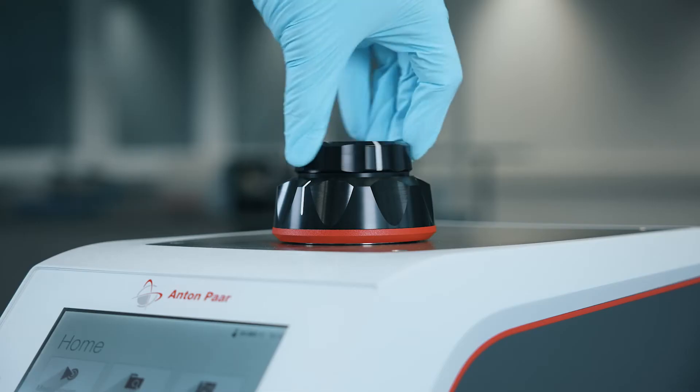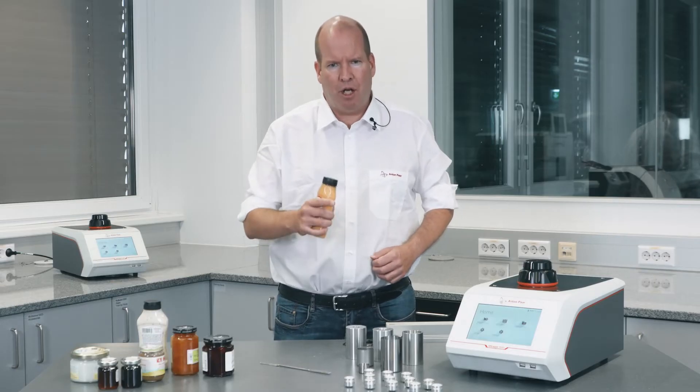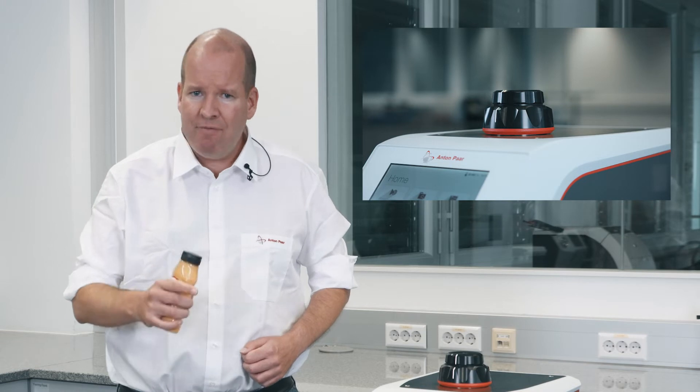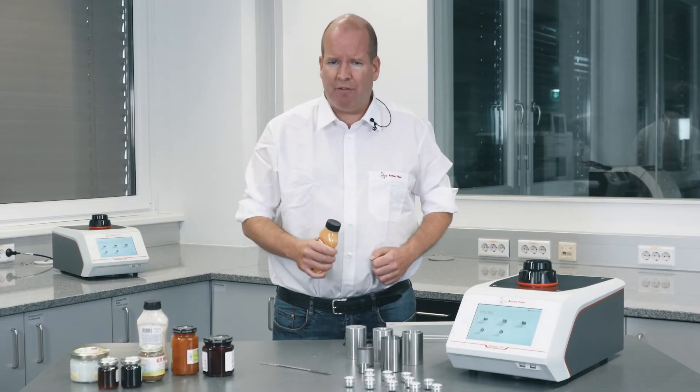To measure density, the Ultrapyc uses the gas displacement method, determining the amount of gas required to fill a chamber with and without the sample. The True Lock lid is specifically designed to ensure a consistent sample chamber volume every time you close it — otherwise any variability here will appear to be coming from your samples.